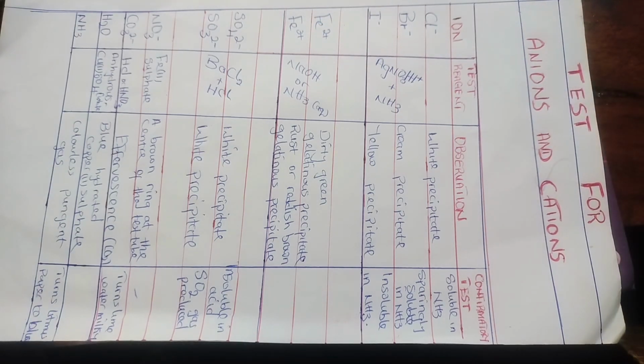Let's move further to the sulfate and the sulfite ion. To test for the sulfate and the sulfite ion, the reagent used is barium chloride plus hydrochloric acid. Further tests or observations will tell you if it is the sulfate ion or the sulfite ion present.